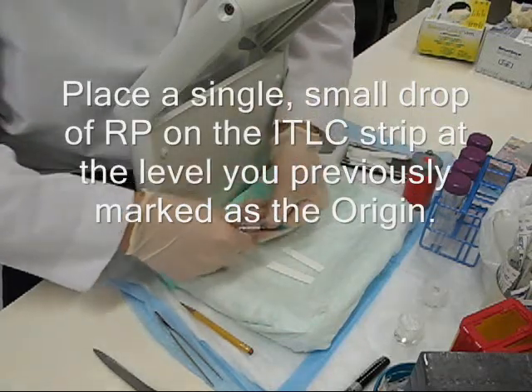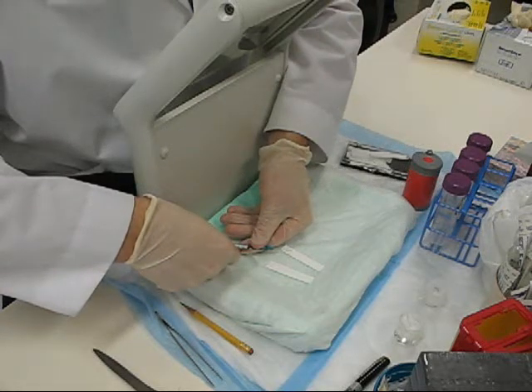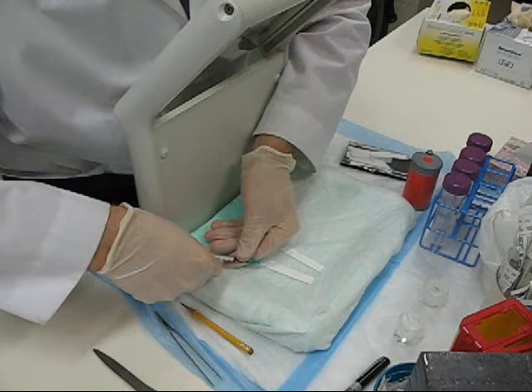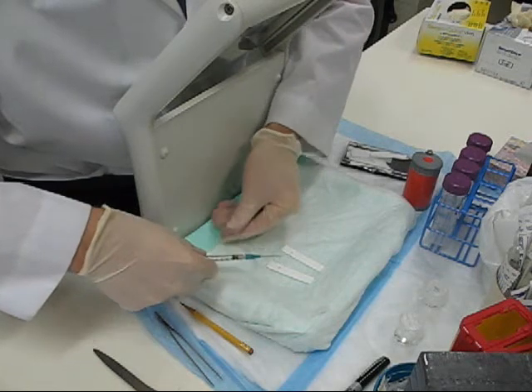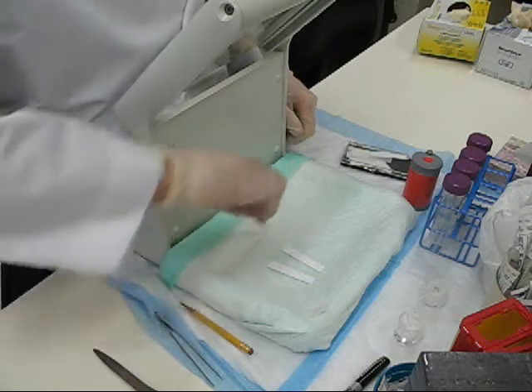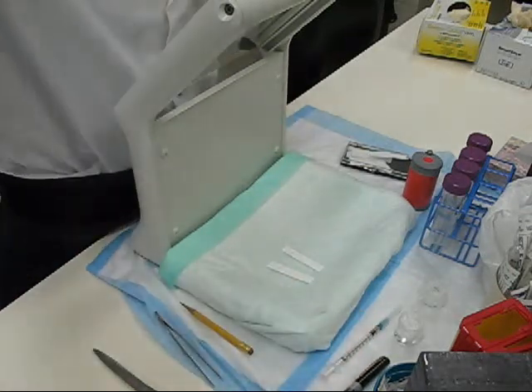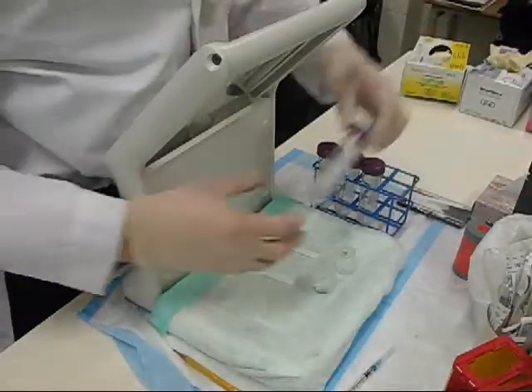Bevel down. We're going to make a sandwich.